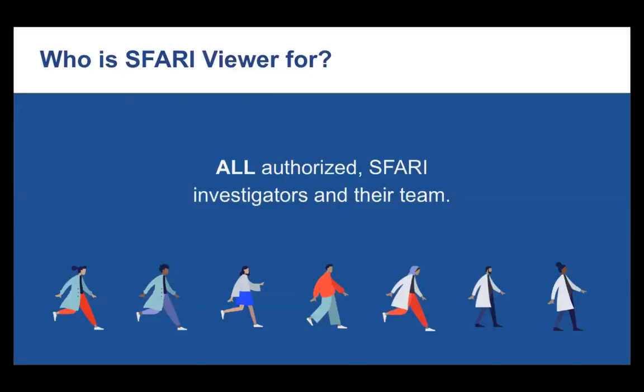So we've made a great deal of effort to really focus on making sure that these tools are really driven by visual means. And the goal here is to make sure that everybody who is authorized to see the data can make use of this tool to search this very rich data set.